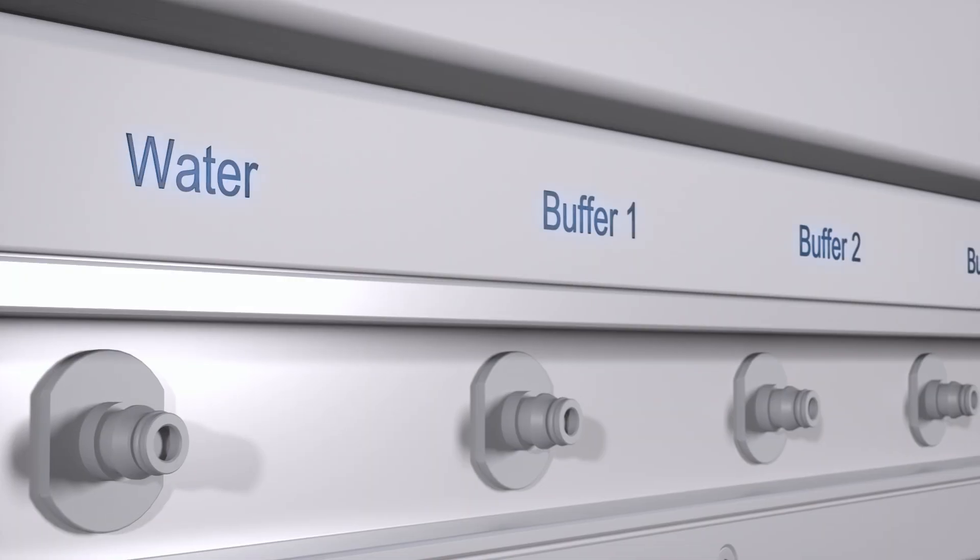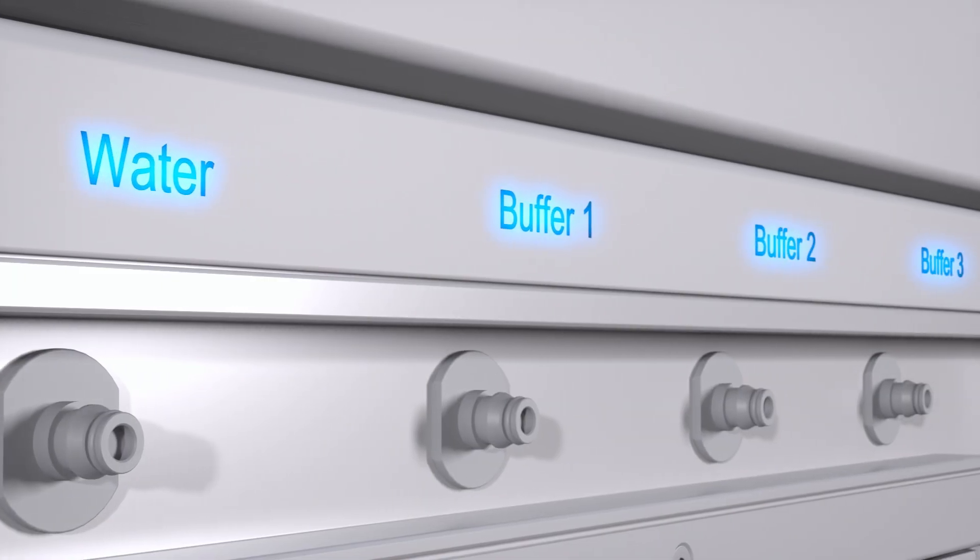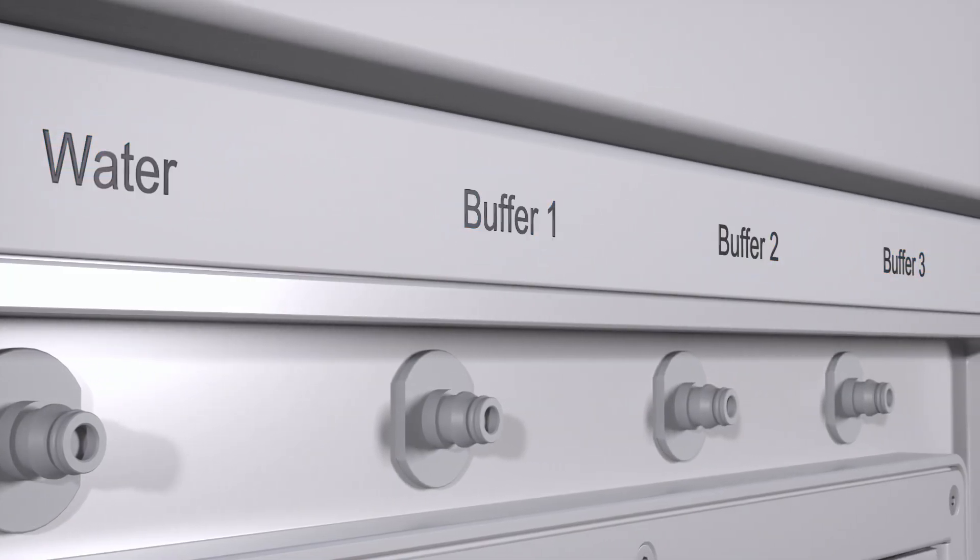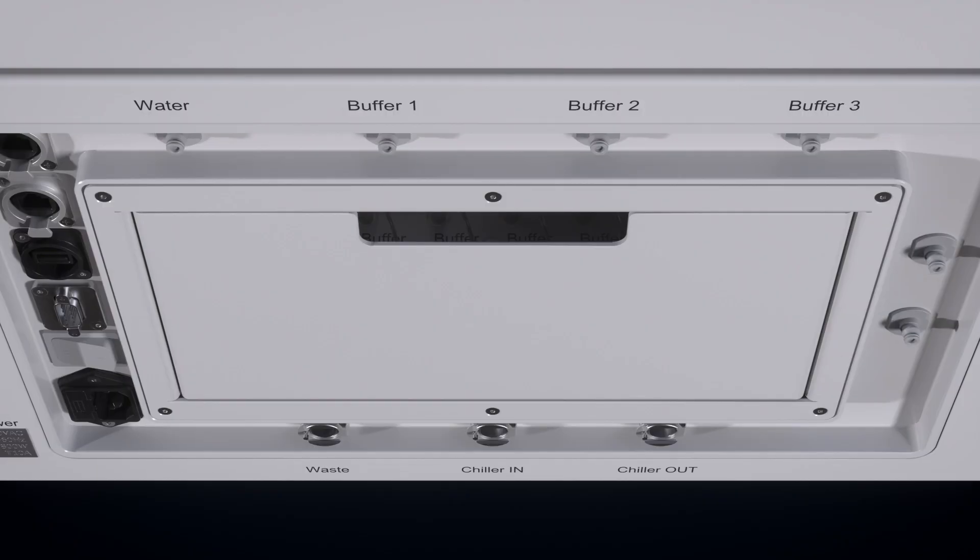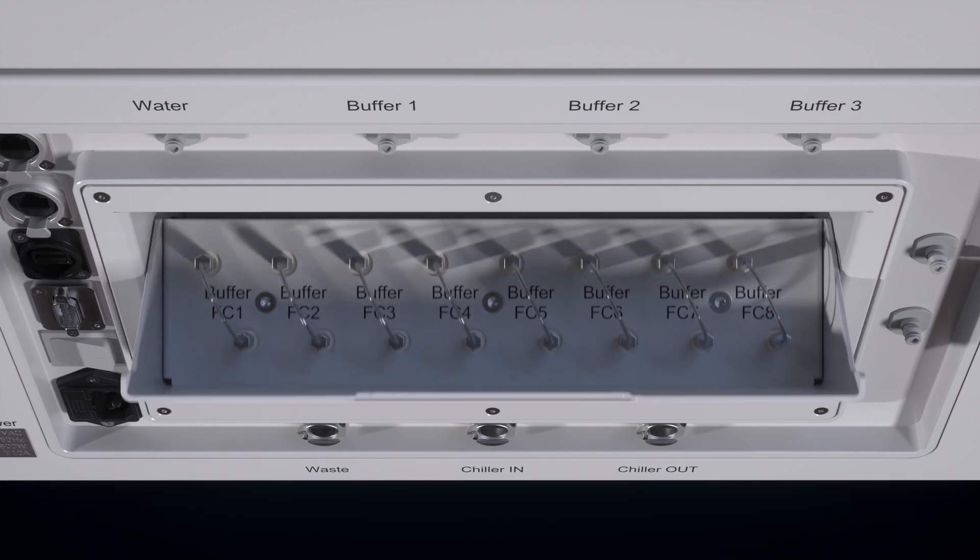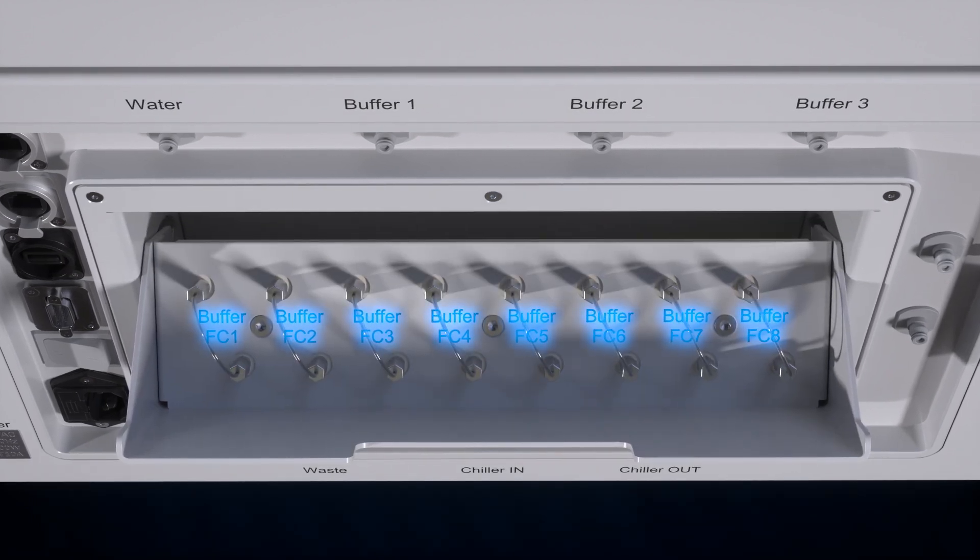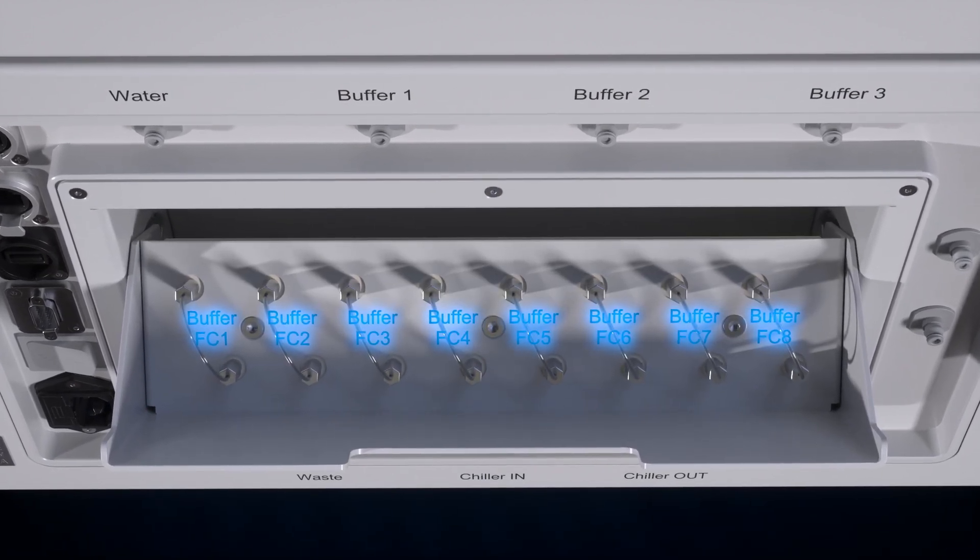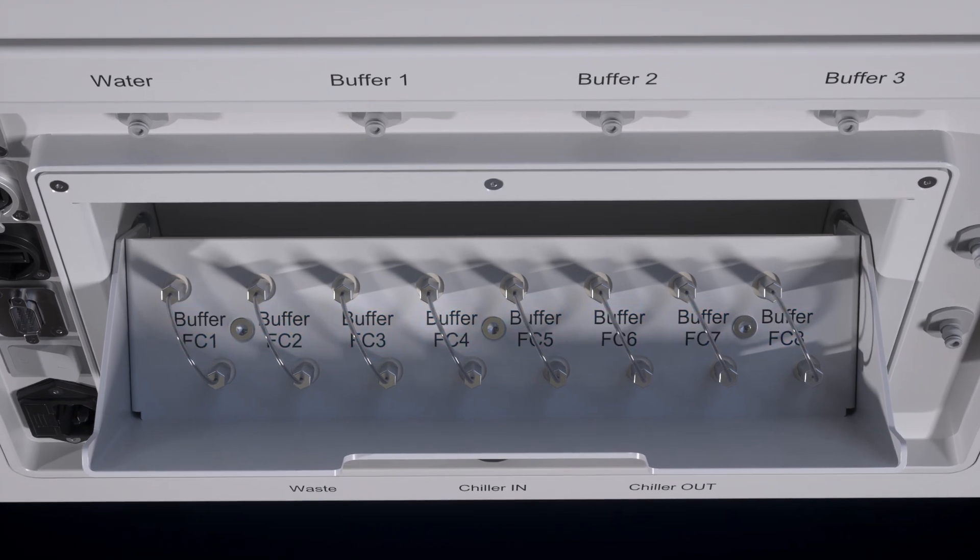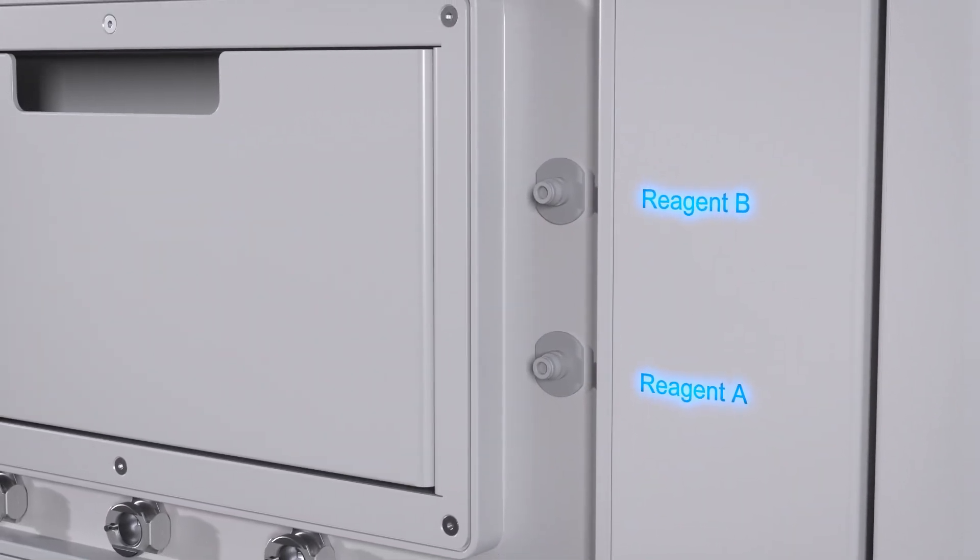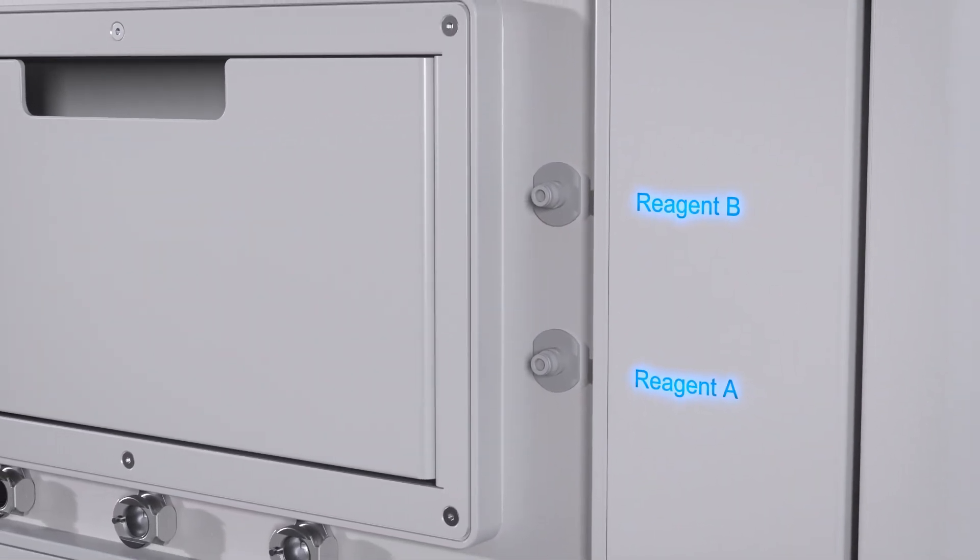The instrument can be configured either to use a single buffer within all eight channels, or to use eight different buffers in parallel. Especially extensive assay development and multiplexing applications can be simplified enormously.